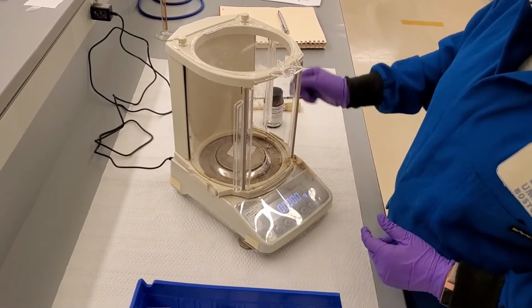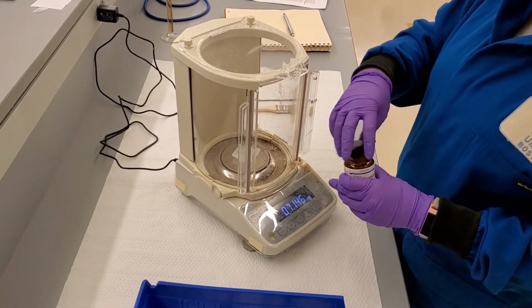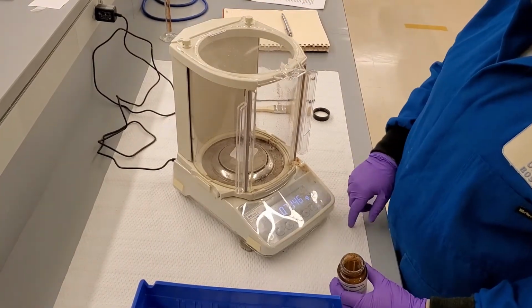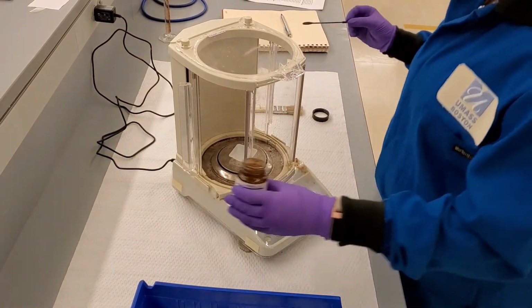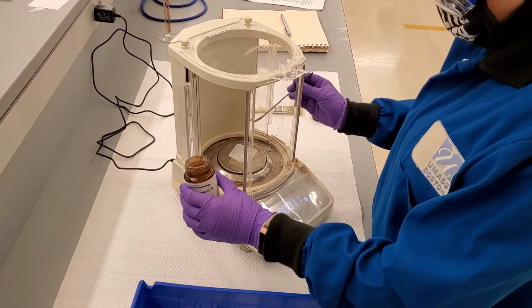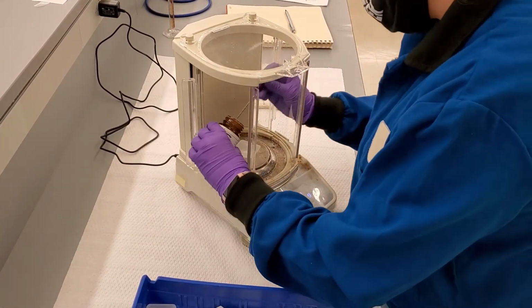Next, we will weigh about 0.060 grams of sodium borohydride into a weigh boat. Place the weigh boat on the balance, close the doors, and tare the balance. We need to be extra careful when weighing the sodium borohydride because of its reactivity and associated hazards. Record the final amount in your lab notebook.